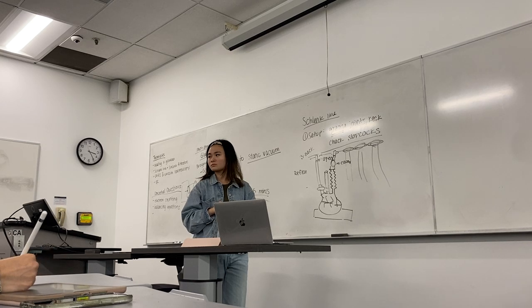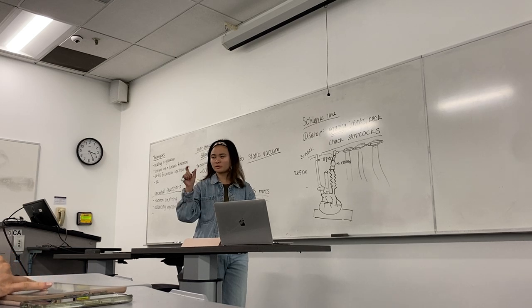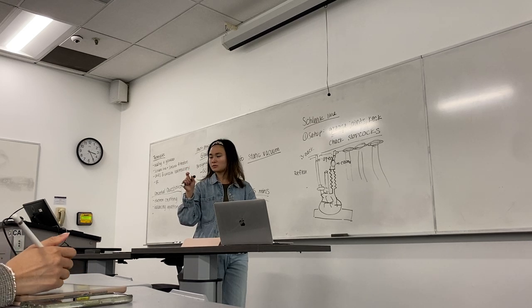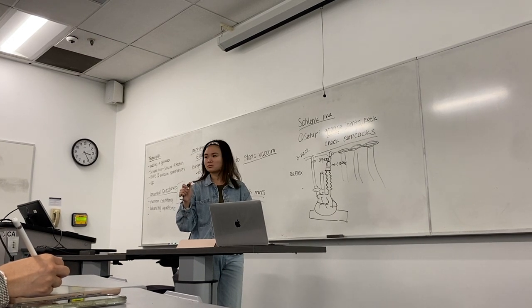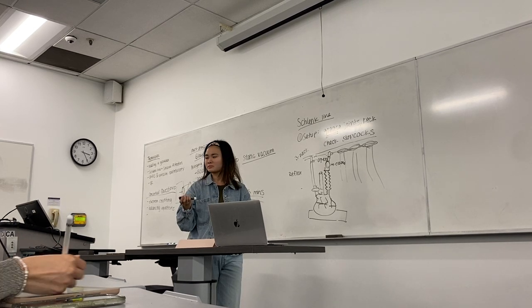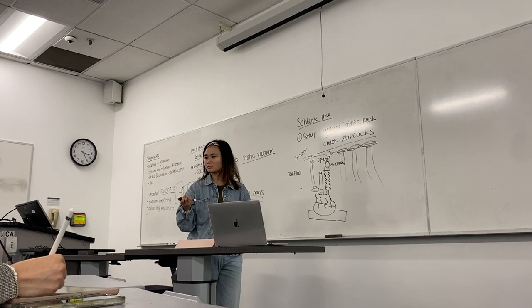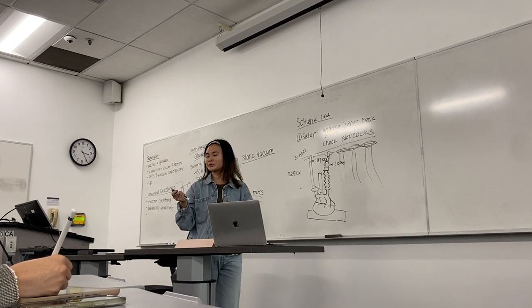You won't have to take off the little pin on the stopcock. You mean the clip, the metal part? Was it the clip or the wire? It was a little metal tab that we have to take off. So yeah, the clip. So I remember people were taking them off to make sure it's oiled or something. Oh, I'm not sure. I don't know.